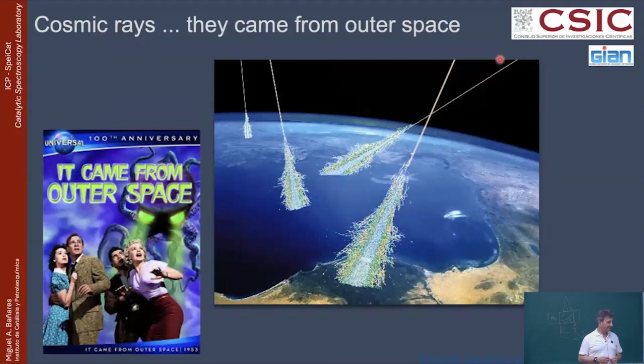With increasing loading, at low loading, when I go to higher temperature, I see fluorescence. With full monolayer coverage, when I go to higher temperature, fluorescence is quite a bit suppressed. Exactly. So that goes hand in hand with this.